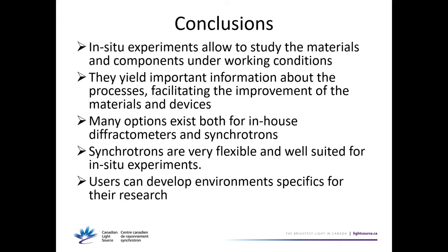Yeah. So there are two cases. We don't have the hazardous gas exhaust system, so for experiments that require a flow of a hazardous gas, the requirement is to have the hazardous gas diluted below some critical concentration. Now, if you want a static atmosphere and a small volume, then you can have pure hydrogen or the X or Y gas, as long as it's static and a small volume. I'm not sure what would be your case.